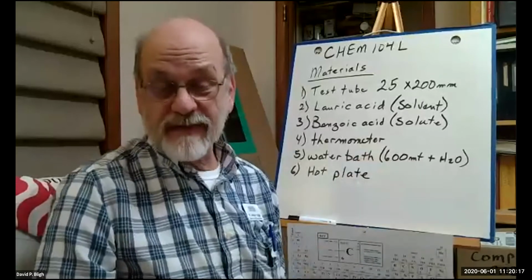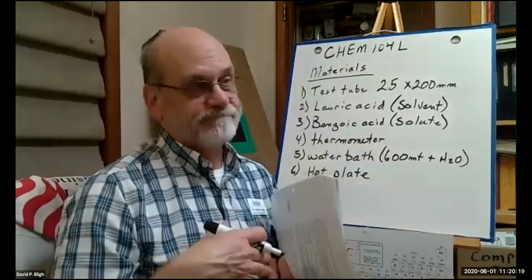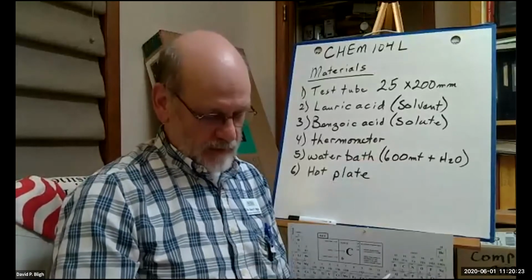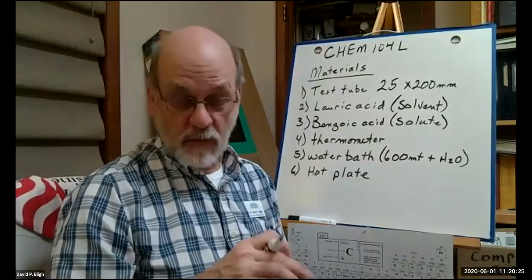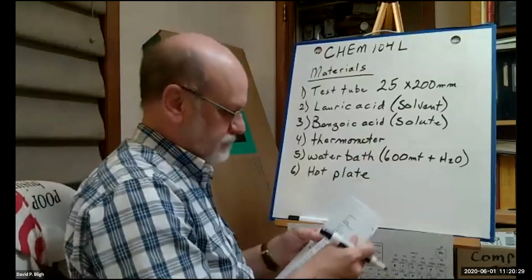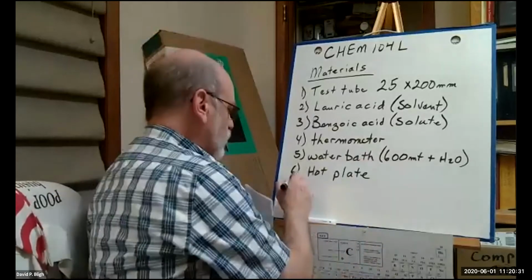Now, when you read the method, it might call for a Bunsen burner, right? But we actually used a hot plate. It's safer. And we need a ring stand.